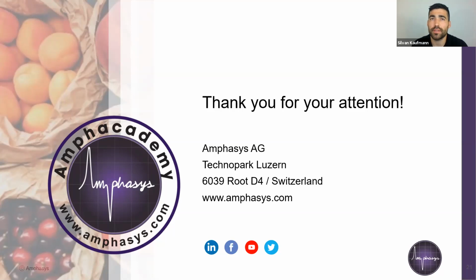Then we had two questions on this Pollen Lifetime experiment. One participant asked what the conditions were in this experiment. The conditions were at room temperature, or basically outside. It's really important to do it outside and at room temperature, or at 25 degrees, because if you want to collect the samples in the field, it should have representative conditions. It does not make sense to chill it and do the lifetime, when in the field you have higher temperatures. I also showed results that if you chill it, you can maybe delay the pollen viability loss a little bit. But basically the conditions were field conditions.